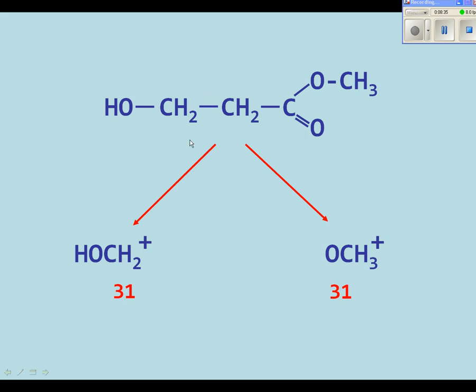And so this ion could form, the CH2OH, and that would then move through the mass spectrometer, or an OCH3+. So this section here could fracture. So in this ester, the methyl component of the ester here could break off and move through the mass spectrometer. Now, there are many other fragments possible. It's just that I've tried to identify the ones that the syllabus requires that students be familiar with.